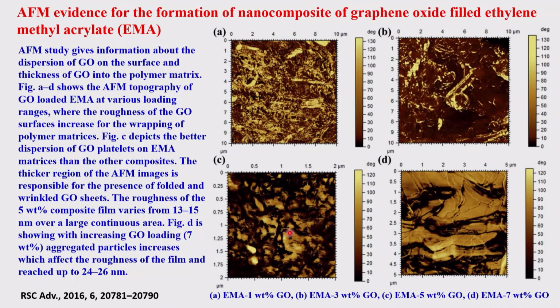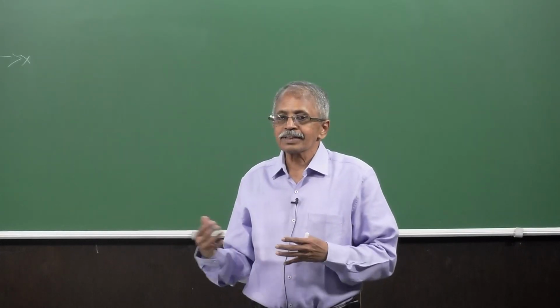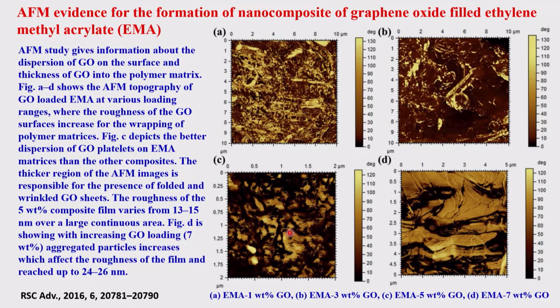Therefore you can select the best nanocomposite to use for further studies, for further properties. So this microscopy will help you to choose the best samples. Of course you can take the somewhat worst sample and also check those properties, and you will know that the properties are not good for those kinds of samples.